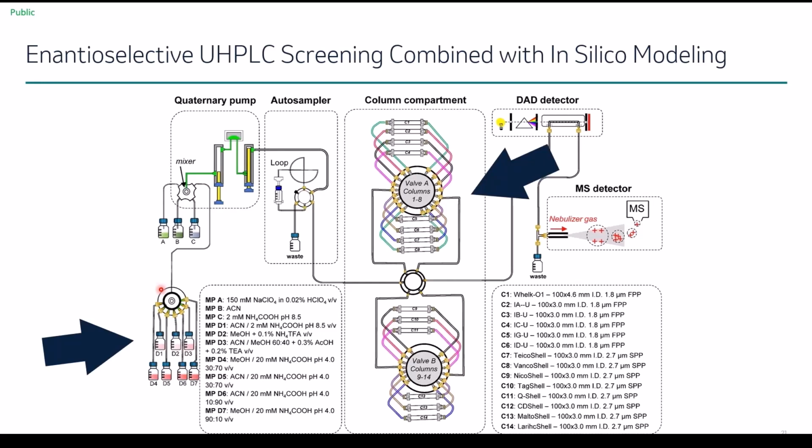In chiral, we know that supercritical chromatography has become the gold standard for this kind of separation. However, liquid chromatography is always easier to translate or transfer, especially if we need to provide this method to people who are not really experts in chromatography separations.